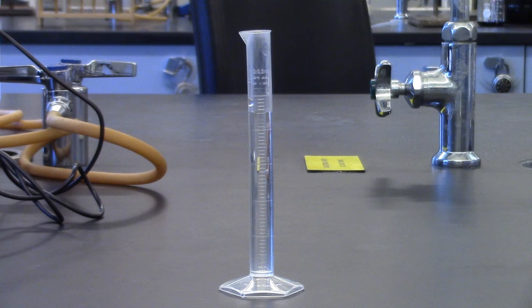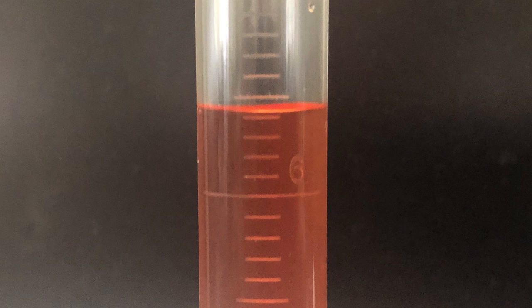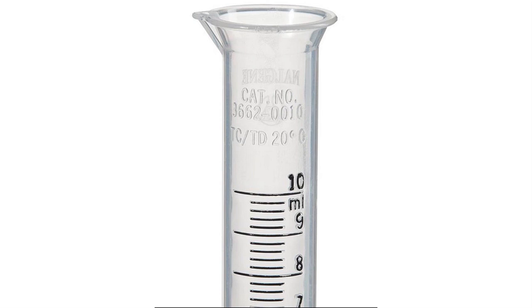You may occasionally use plastic. An interesting feature is that plastic, like oil, repels water. Because there is no adhesion, there is no meniscus. Plastic is usually marked TC/TD because it will deliver all it contains.